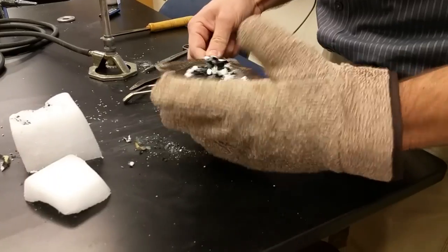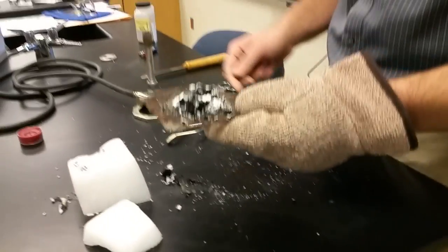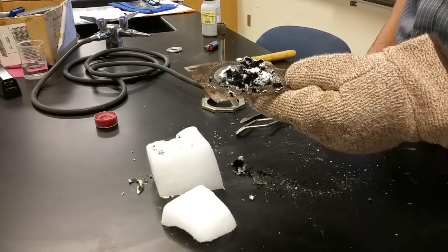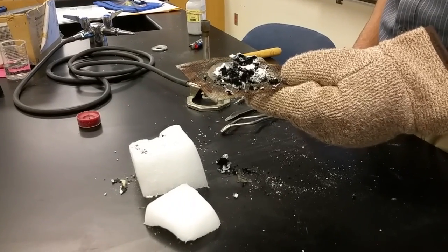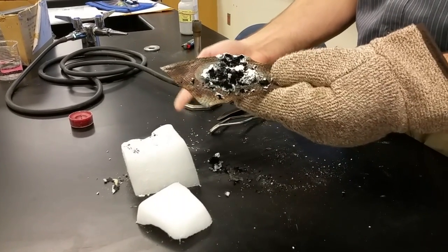Okay. So what's the black stuff? Carbon. Where'd the carbon come from? The carbon dioxide. From the dry ice. From the carbon dioxide, which is solid.